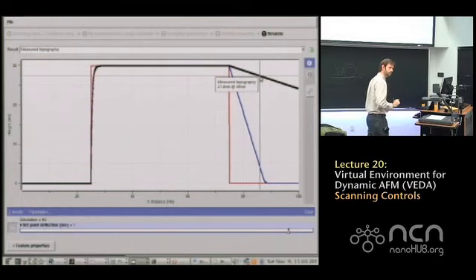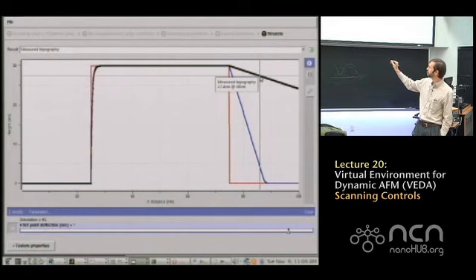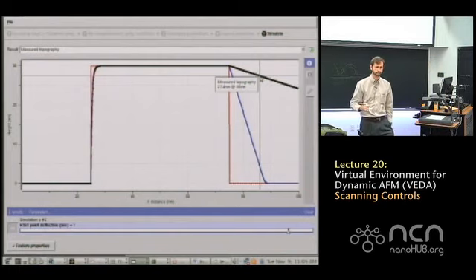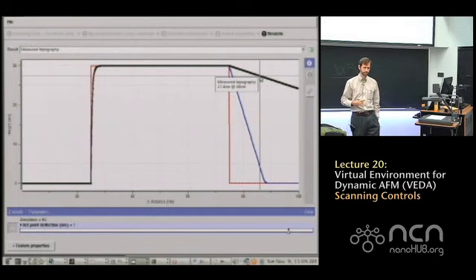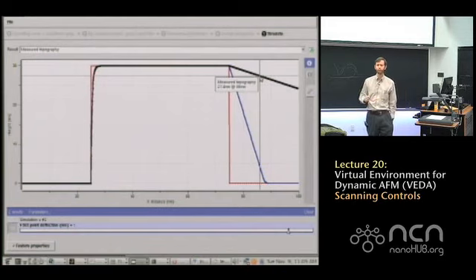So you increase the force? They increase the set point. So I'm pressing harder on the sample. Because when the sample falls away, this is contact. Okay. Yes, it's contact mode, just that in contact versus tapping, we use different terminology for set point. Yes. In contact mode, you increase the set point as you press in further, whereas in tapping mode, you decrease the set point. So I'm putting more force on the sample.